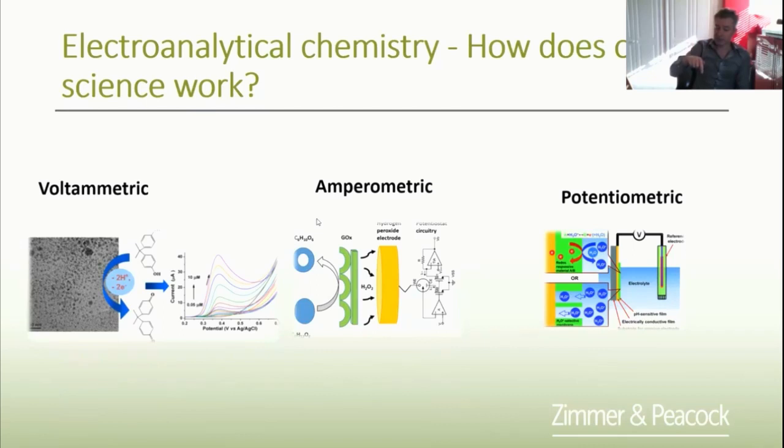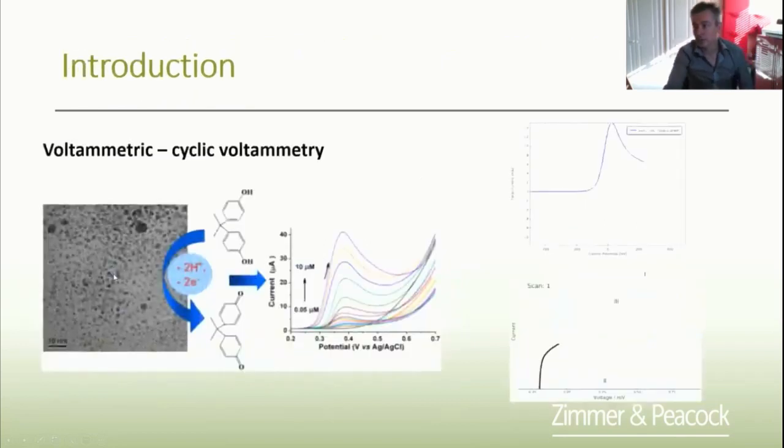So in a bit, I haven't introduced him, but Andre is in our lab in Norway at the moment. So I'm near London in the UK. Andre is in Norway at one of our labs, and he's going to be doing a voltammetric experiment for you. And then he'll be doing a potentiometric experiment later on, and then finally an amperometric experiment. But it's worth just saying, a voltammetric experiment, well, let's go and talk about voltammetry to start with.